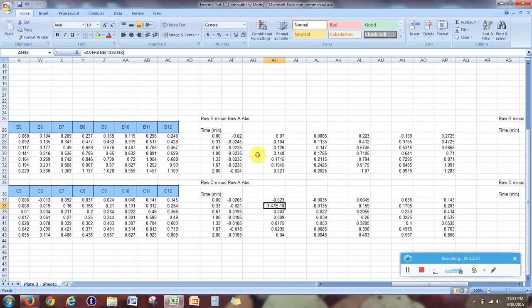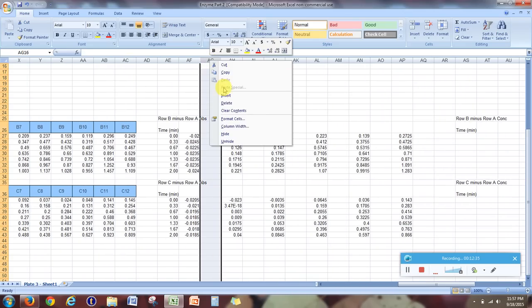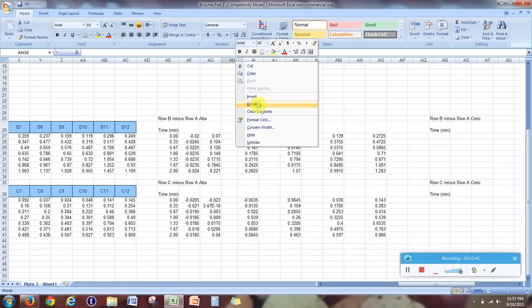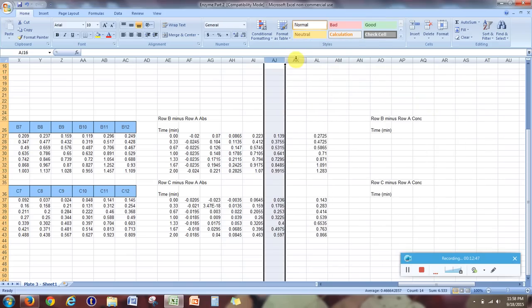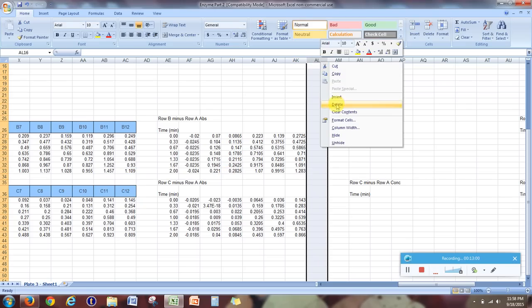Now you have all these empty columns. Well, nice thing about Excel is you can actually just go ahead and delete these columns. So I'm just clicking on the column header, right click, delete, and that just clears up these empty columns, and it won't mess up your formulas or anything. So we can double click, like on this last one for example, and we can verify it's still averaging B11 and B12. So we're good there. Let's delete this one more to clean it up.